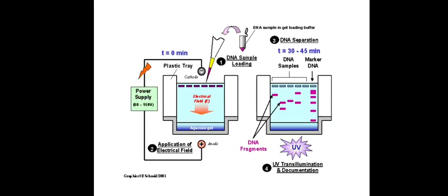You'll have to go for a suitable blotting technique. Then you can get it on a sheet. Then you can expose it to UV light. You can locate it if needed by directly removing it from the DNA gel. From the gel you can just punch it off, and then you can also analyze the DNA, the molecular weight of the DNA. That is also possible.